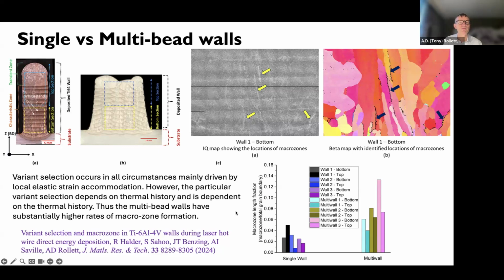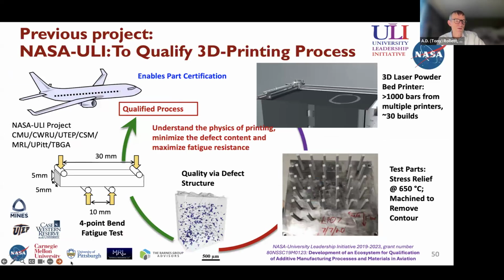We're not claiming that we fully understand how this is happening. It's maybe best to say it's just some speculation that it relates to the different thermal histories and different thermal stresses. But it is, I think, a pretty strong argument for the value in doing large area EBSD as well as the fine scale work. Okay, so I'm going to finish by talking about fatigue.